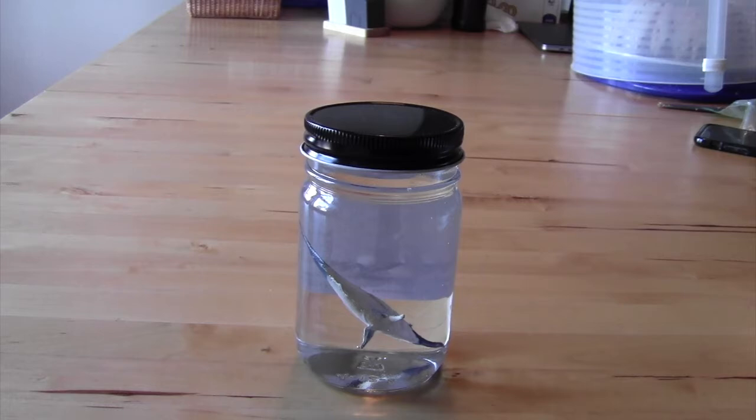One at about 10 degrees Celsius, one at about 20 degrees Celsius, which is almost room temperature, and one at about 30 degrees Celsius. Each fish will stay in its jar for a different amount of time. The ones in the warmer water should have a higher metabolic rate, and they should go through their oxygen more quickly, so we're only going to leave them in the water for about 30 minutes. The one in the cold water should have the slowest metabolism, so we're going to leave that in there for 90 minutes. And the one at room temperature will stay for about an hour.